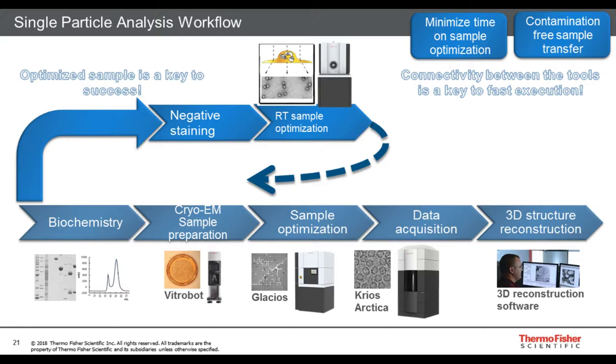So this is a 200 kilovolt microscope, FEG tip for those who are actually experts on microscopy. It has an autoloader to load multiple samples actually at the same time in the microscope, and also efficiently screen those samples and select the proper sample for further analysis. Another advantage of this microscope is that the Glacios is pretty small. It's not a very high microscope, so it also fits relatively easy into many lab rooms.